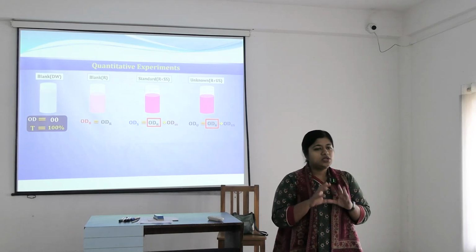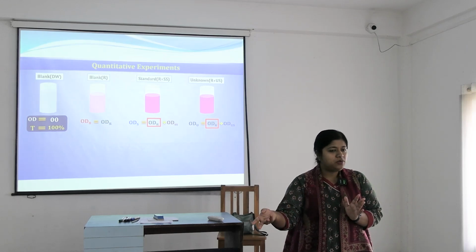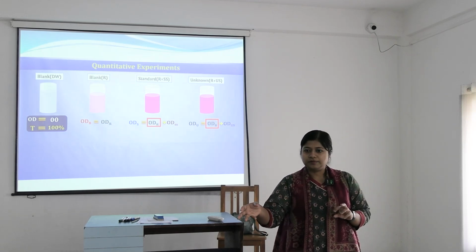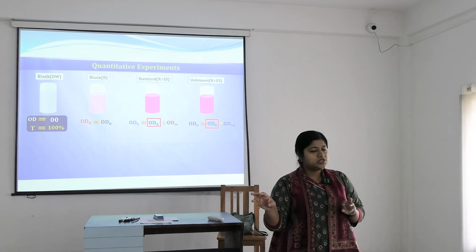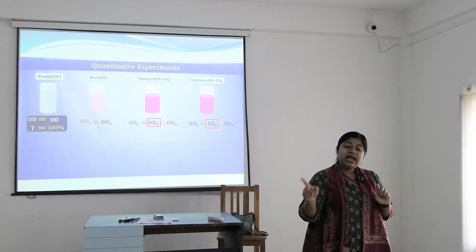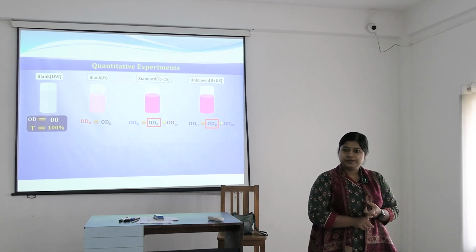That means, if I run a reaction where glucose is the substrate here, it will produce the same amount of product as the substrate. As much substrate as I give, that much product will be formed, right or not? So the concentration of the colored product tallies with the concentration of our analyte. So by measuring that colored solution's intensity, we will find out the concentration of this analyte.